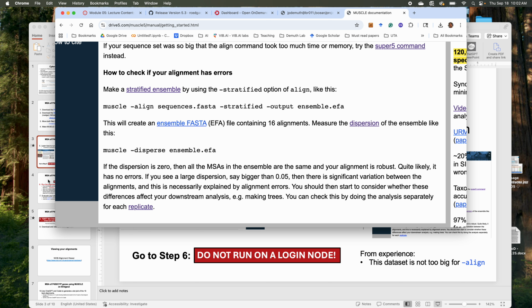Is it working? Yes. I checked that it's there. It's just that it isn't what it's called. It's muscle, slash. Exit the interact. So I have to put this in the... Yeah, except for the first one. And then make sure you add the thread 64 to that.